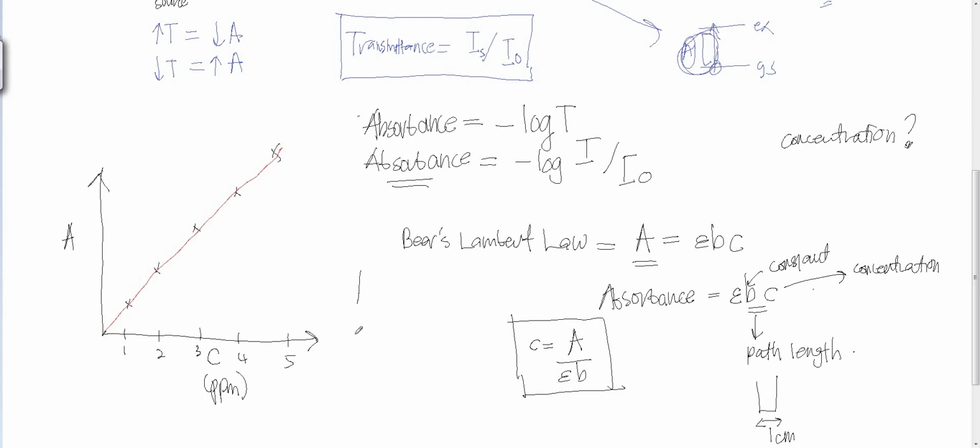Okay, jadi contoh you kata you nak ada correlation between transmitted percentage pula kat sini with the concentration. Can you do that? Yes. The answer is yes, tapi you can expect that, okay, the peak something like this lah. Semakin ke bawah lah. Why? Because semakin tinggi concentration, semakin tinggi absorption. But you know that absorption dengan transmitted it always opposite. So peak yang kita akan dapat adalah dua jenis peak yang berbeza. Okay, so I hope that you really understand on this part.